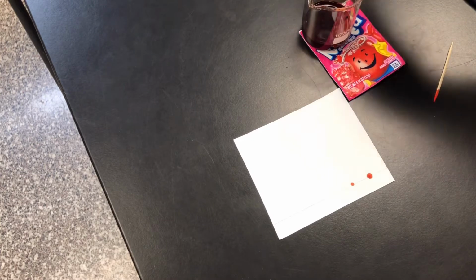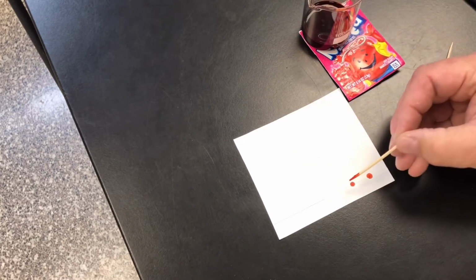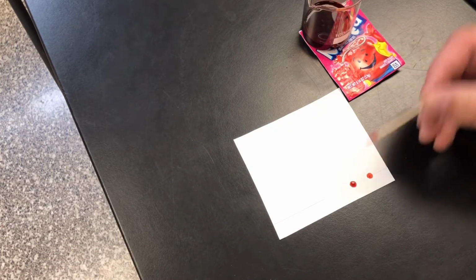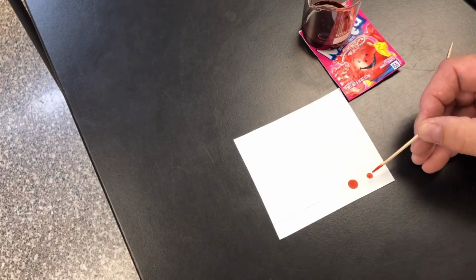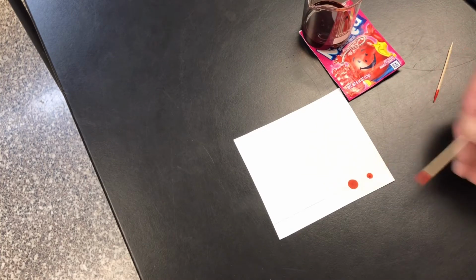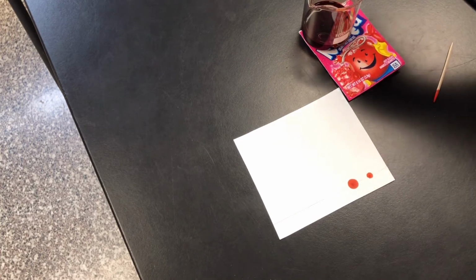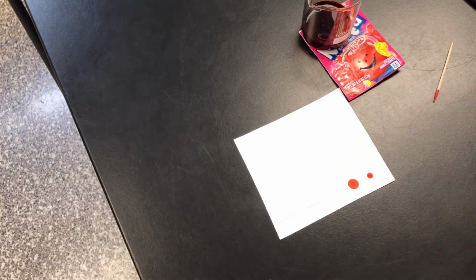As long as it's dry, it won't expand, and then we can get a higher concentration of this material here. So if I continually just keep dropping this, it's going to get bigger and bigger and bigger. But if I allow it enough time to dry, my dot should not be getting bigger. And it'll be more concentrated there.